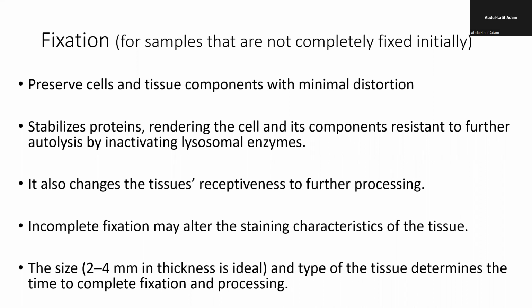And then when you fix the tissue too, it allows for further processing. So as I mentioned to you, the tissue is going to be put in a solid medium that will be there forever. And when the tissue is not preserved well, it cannot be kept well. You can even see if you have a fridge or a freezer that is not working well, if you put your fish inside or your meat inside, what happens to it? It gets spoiled. Okay, so it has to be fixed well. There should be complete fixation so that the characteristics of the tissue will not be distorted.